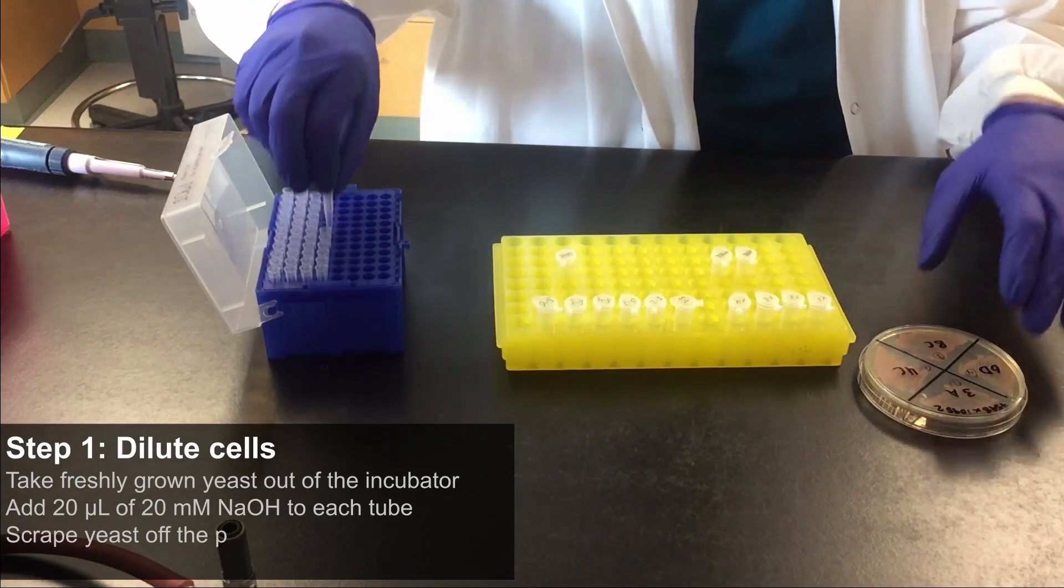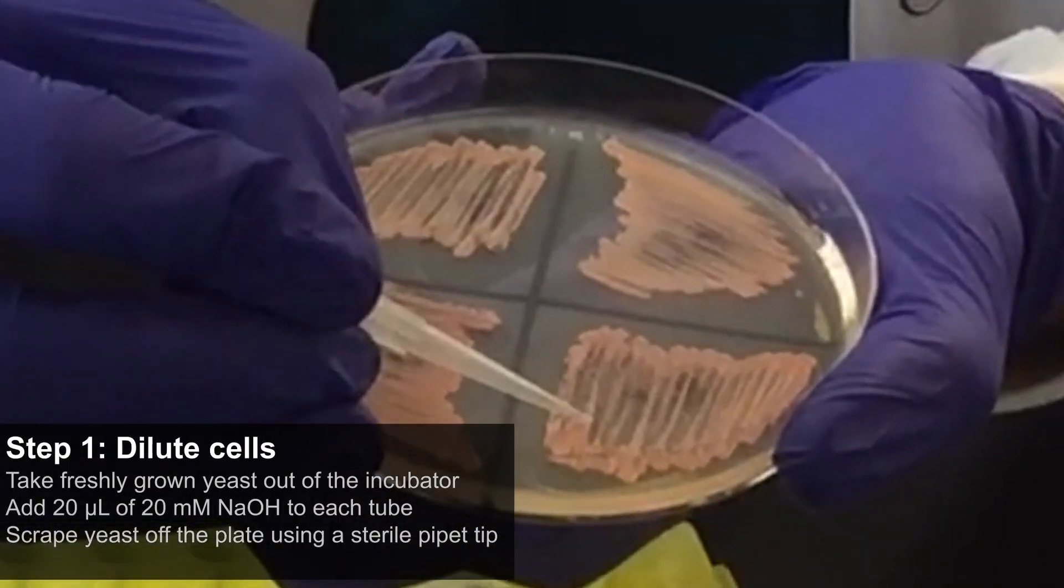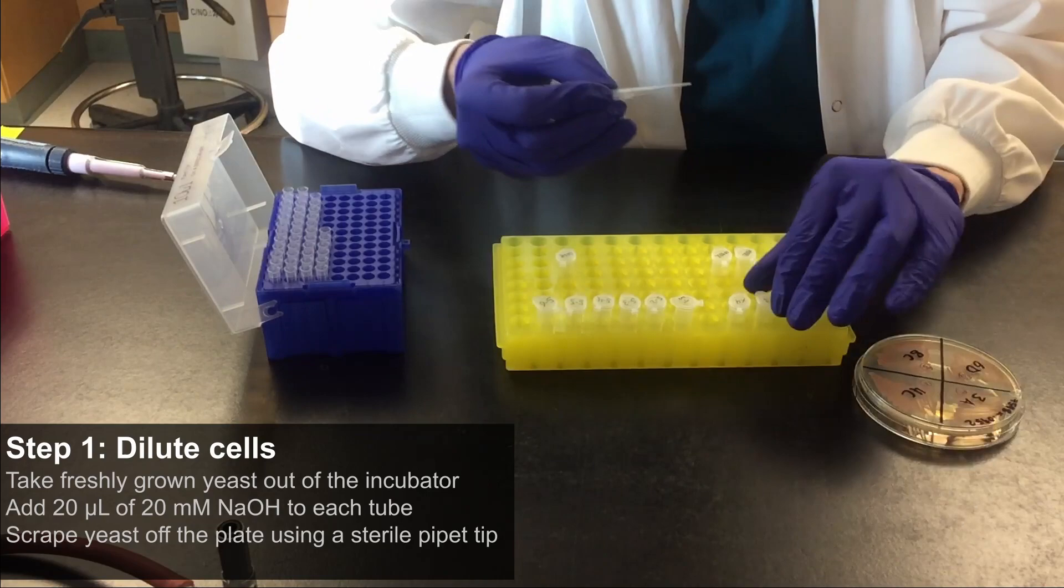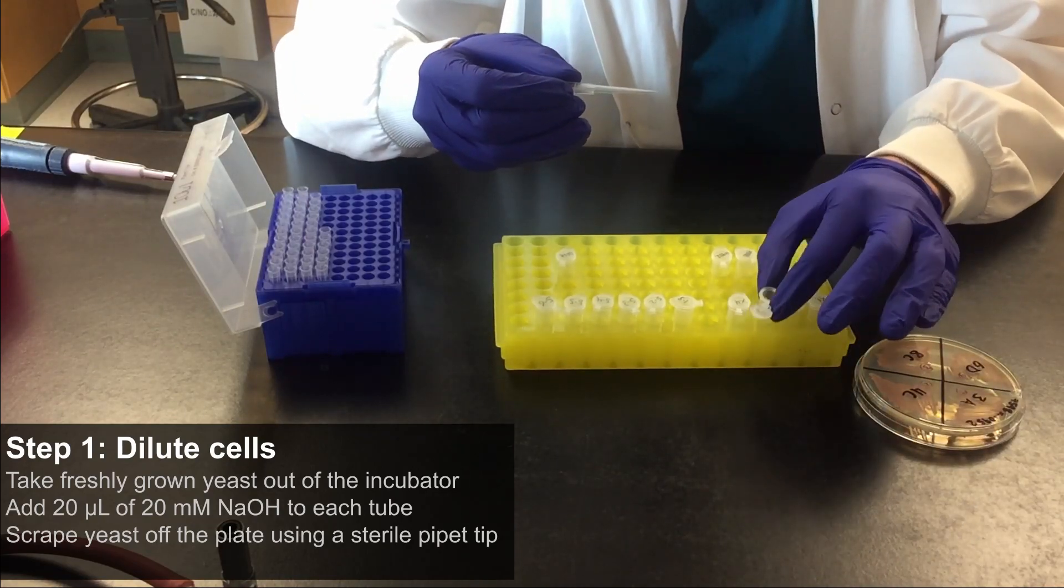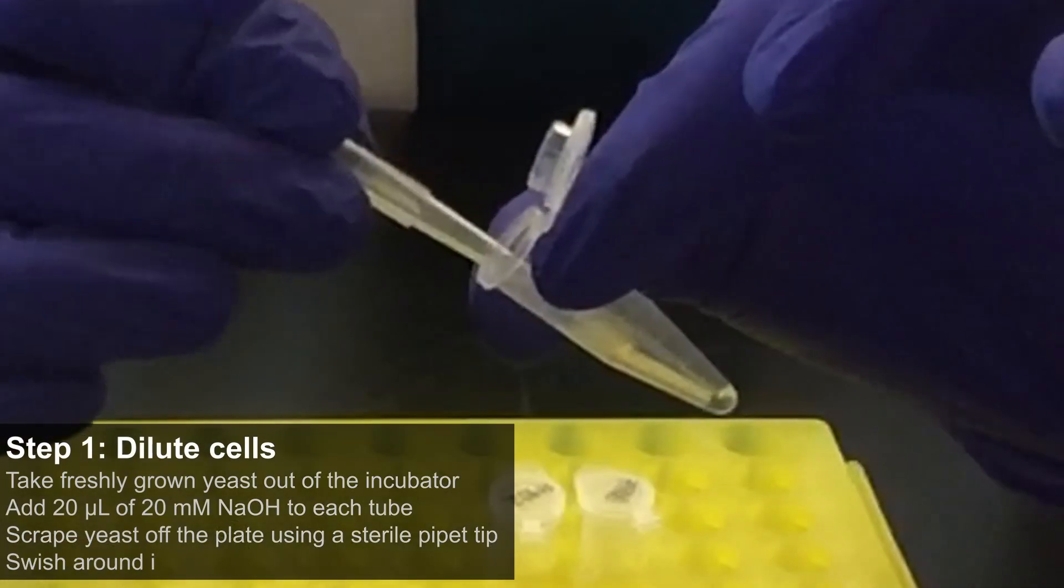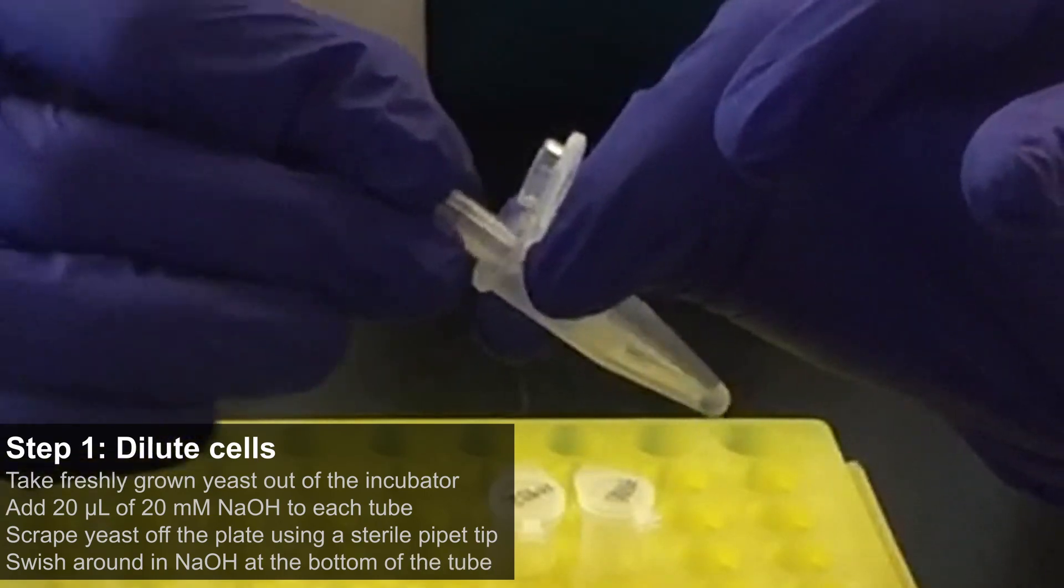Scrape yeast off the plate using a sterile pipette tip. Swish around in sodium hydroxide at the bottom of the tube.